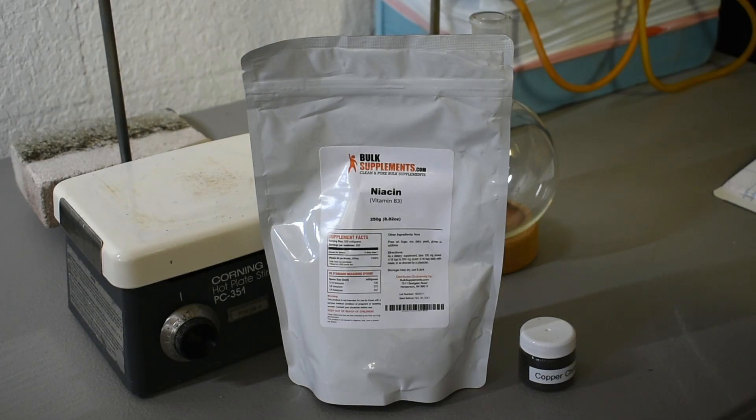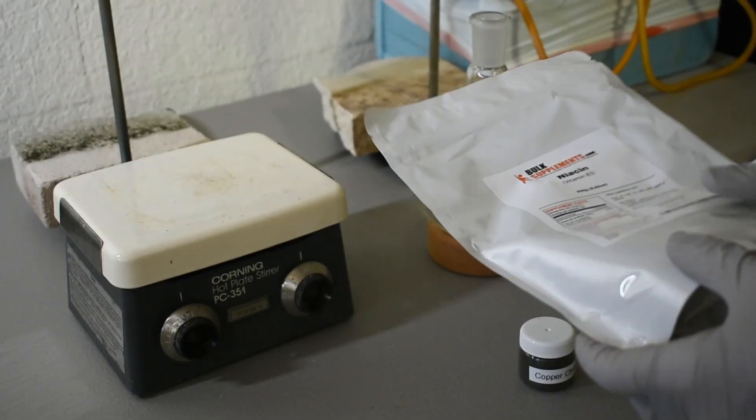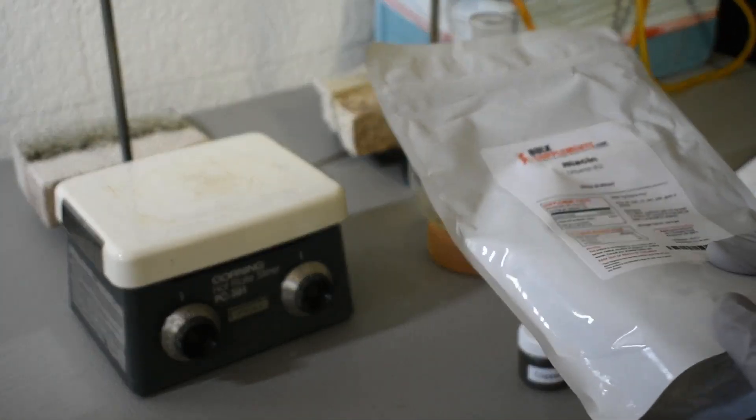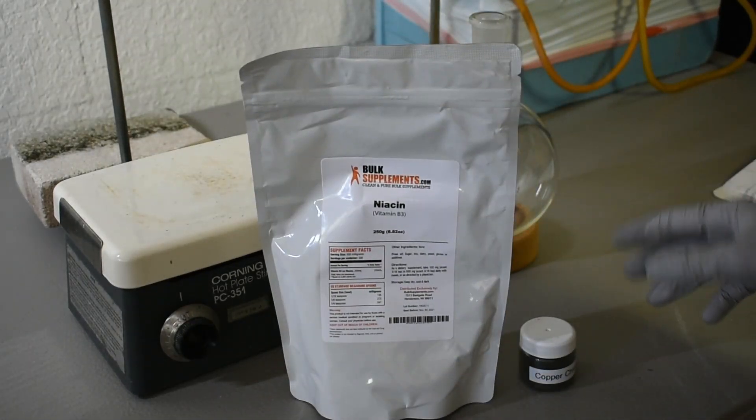This is a pretty simple synthesis, so I'm not going to go into depth. It'll probably be a short video. I bought 250 grams of niacin and did my stoichiometry for 250 grams, but we'll see how much actually ends up being in here and I might have to adjust my calculations.